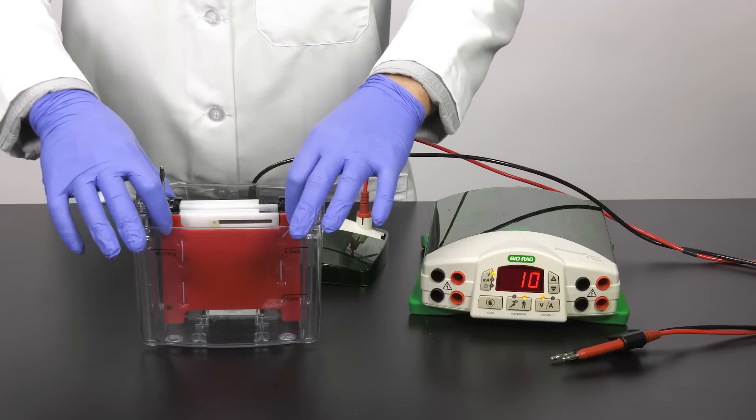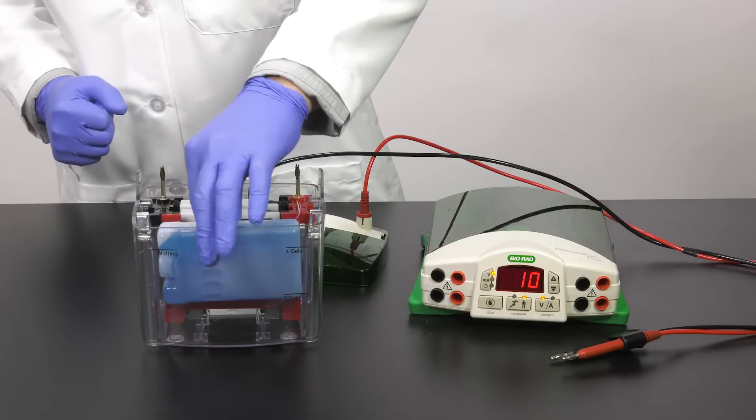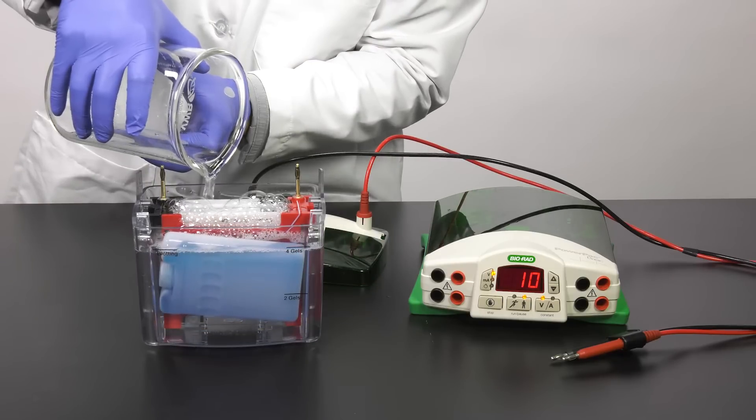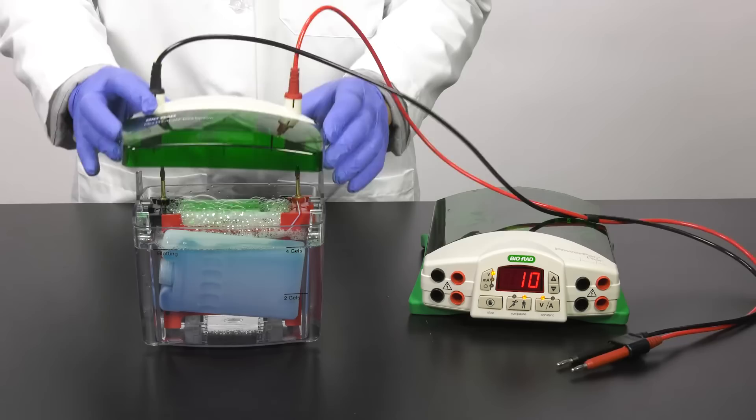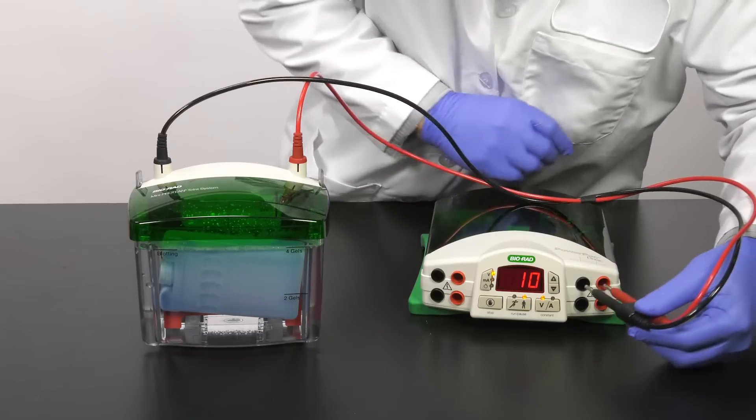Place the module into the transfer chamber. Add a frozen cooling unit and fill the chamber to the appropriate level. Attach the lid and connect the leads to the power supply. Red to red and black to black.